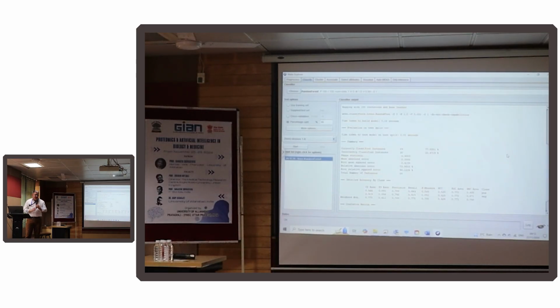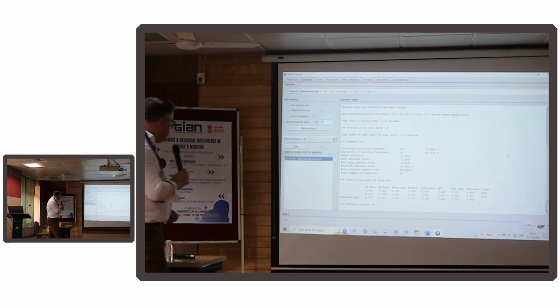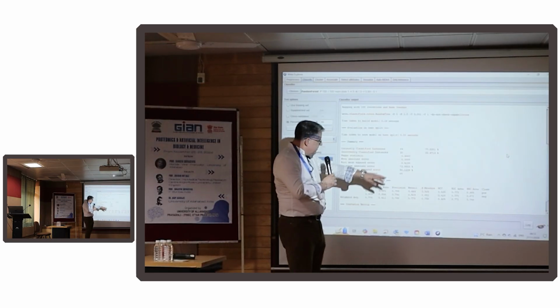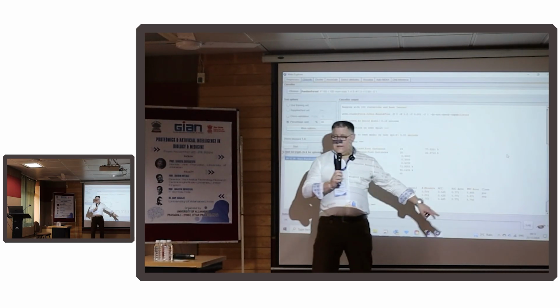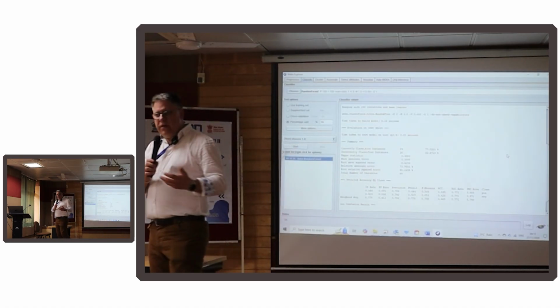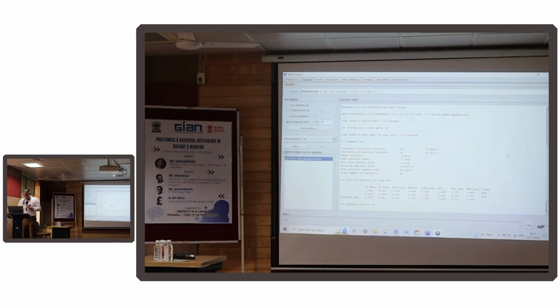So I've got the correct and incorrect classes. I've got the error, and I've got the true positive rate, false positive rate, the ROC area. So I can immediately see how well my model is doing with that method. So I can try that out.